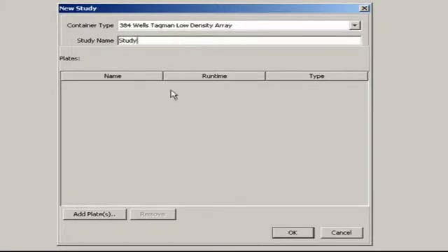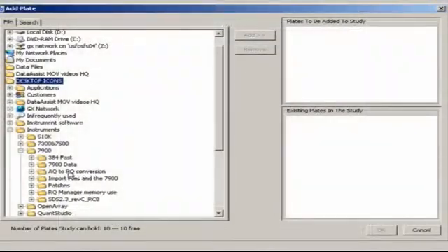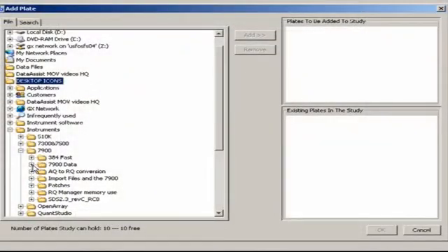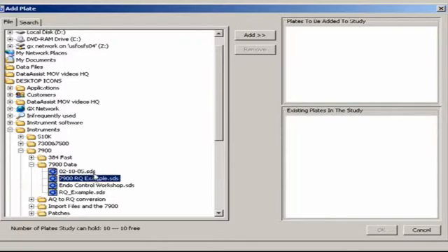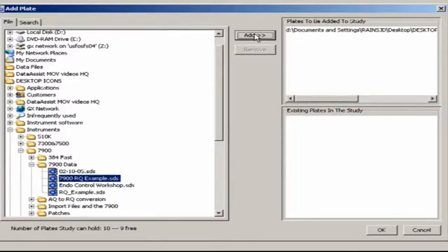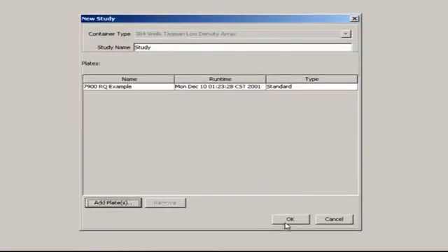Now add plates. Navigate to the folder containing your .sds run file or files. Select it, and add. Once you're done, and you can add a maximum of 10 delta-delta-CT plates to a single study with the 7900, click OK, and OK again.